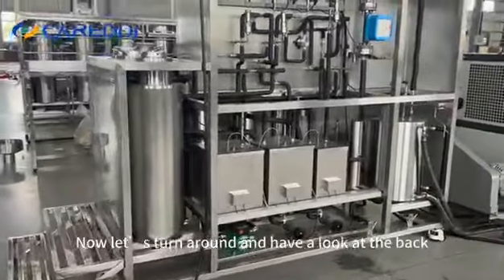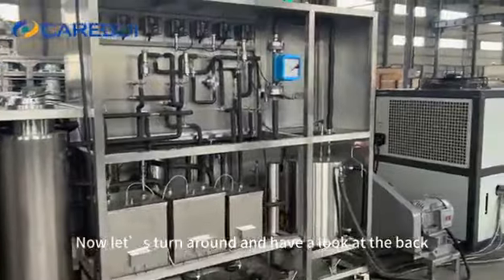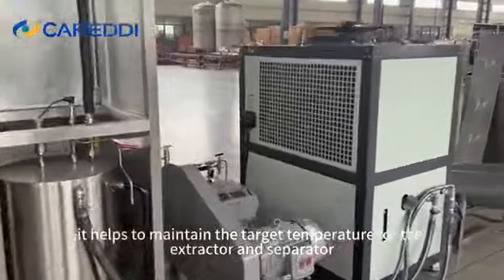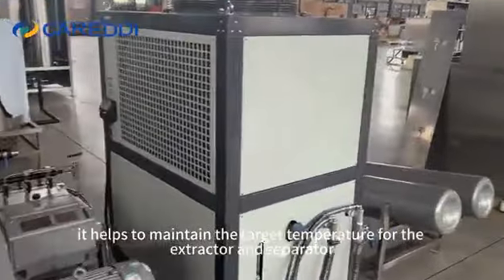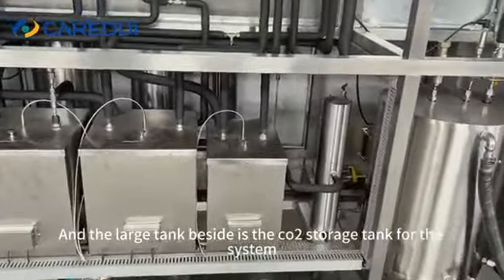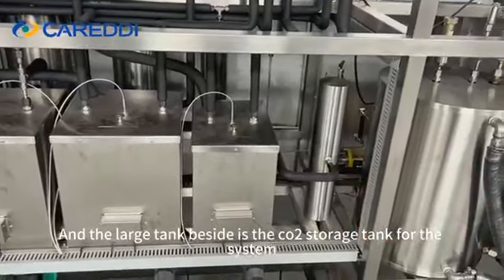Now let's turn around and have a look at the back. We use the water heating method — it helps to maintain the target temperature for the extractor and separator. The large tank beside it is the CO2 storage tank for the system.